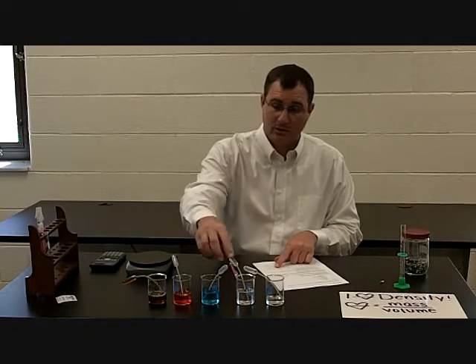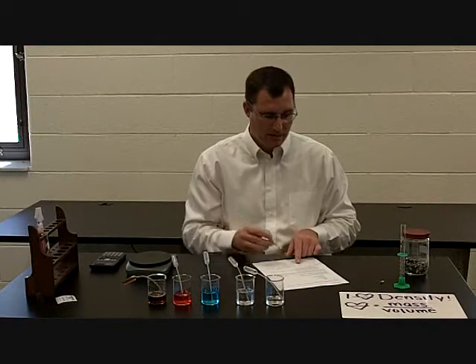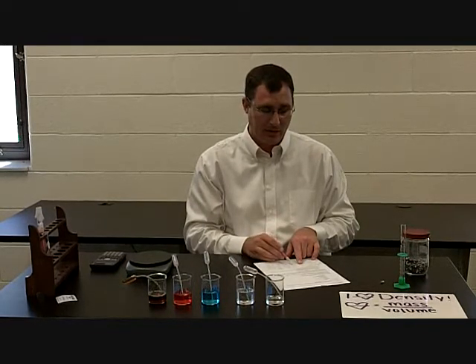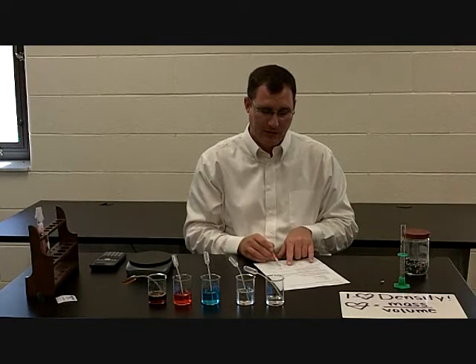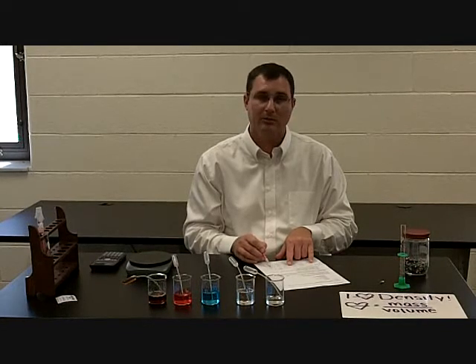So I'm just going to talk you through the other two. The Windex, I would do the same thing, weigh it. When I do that, it weighs 5.6 grams. I subtract the 0.9, and that gives me 4.7 grams. Divided by 4.8 gives me 0.98 grams per milliliter.